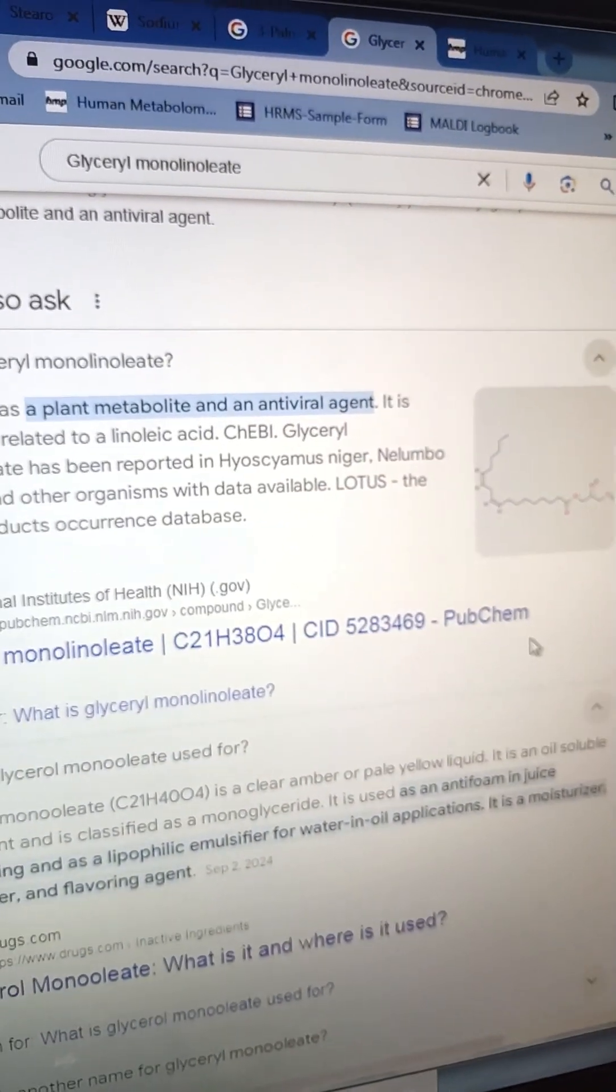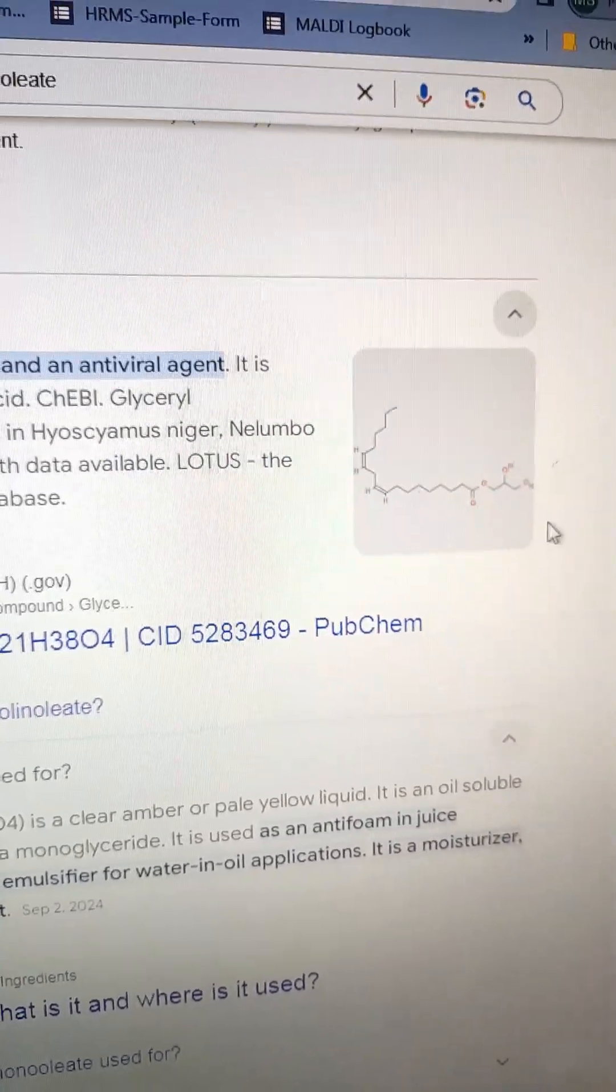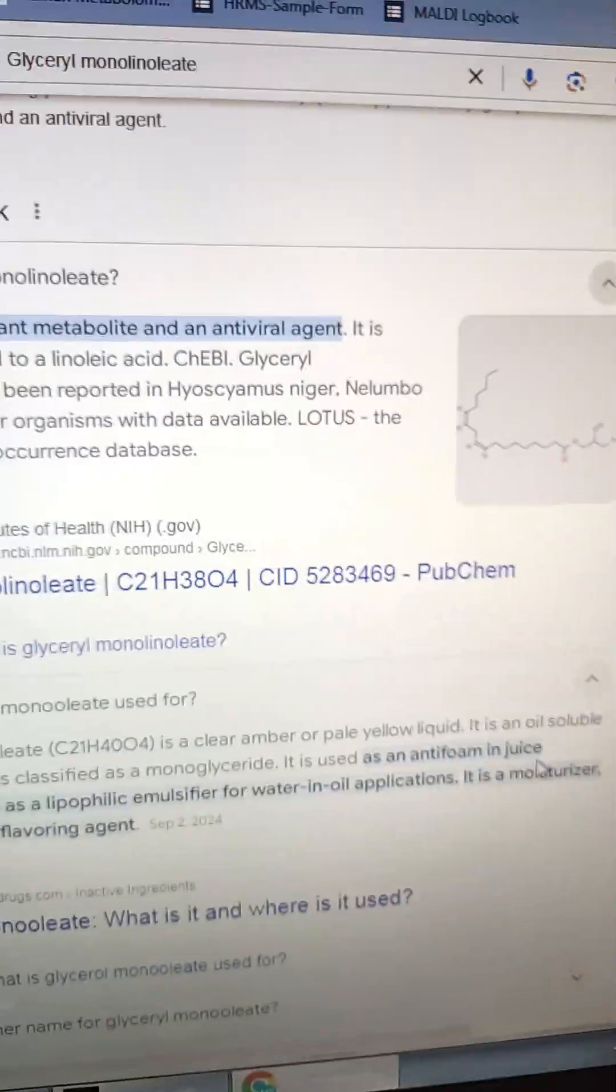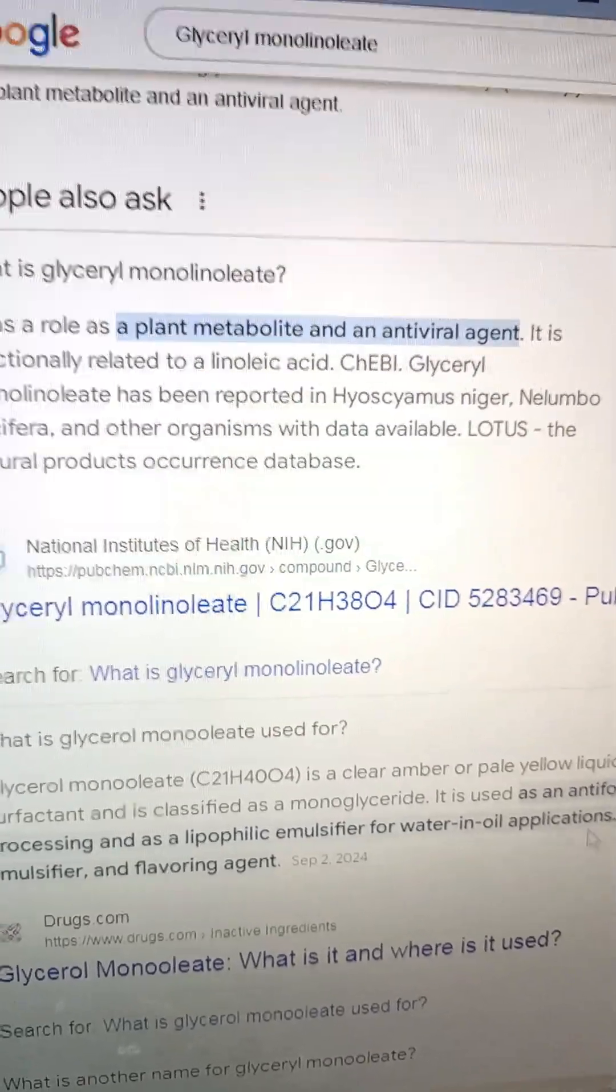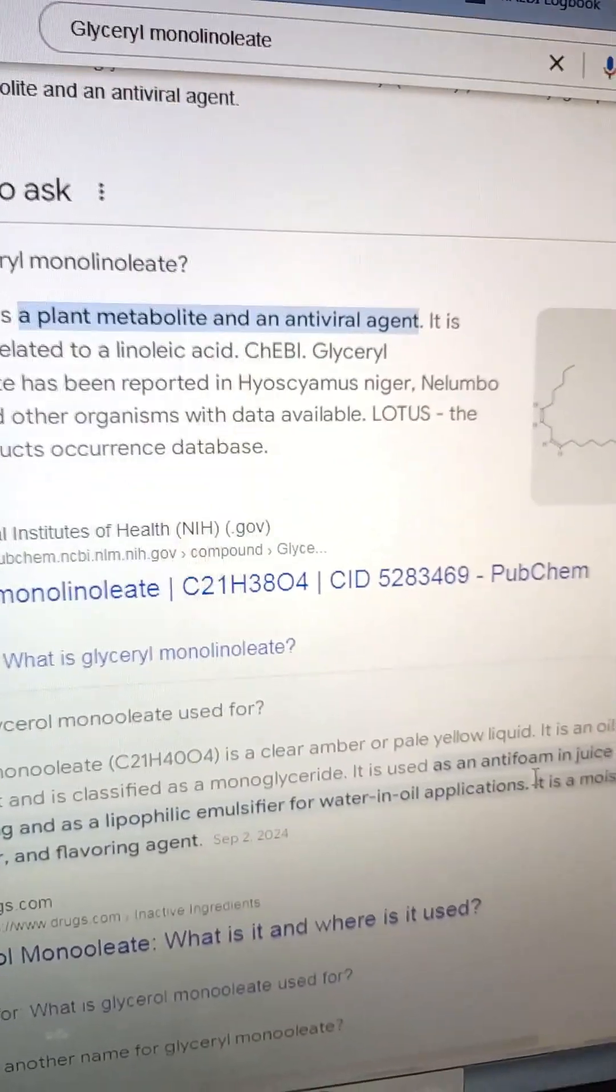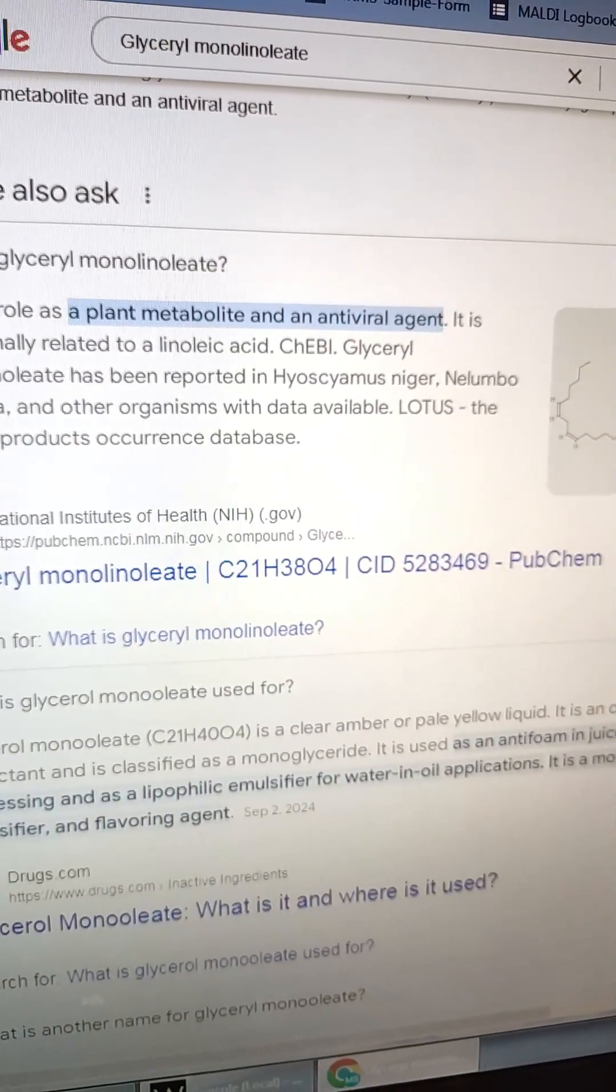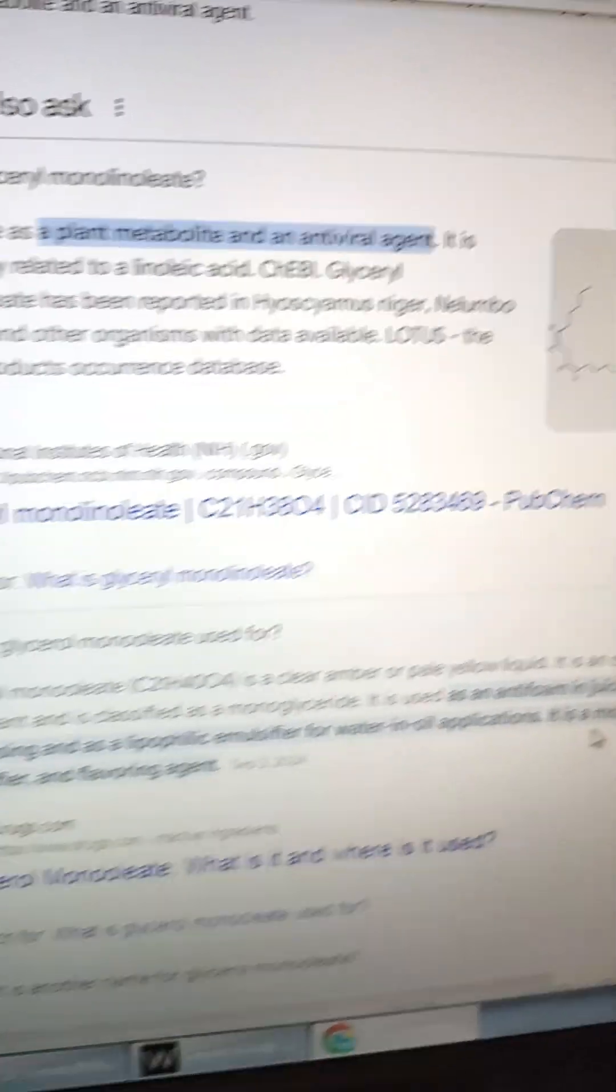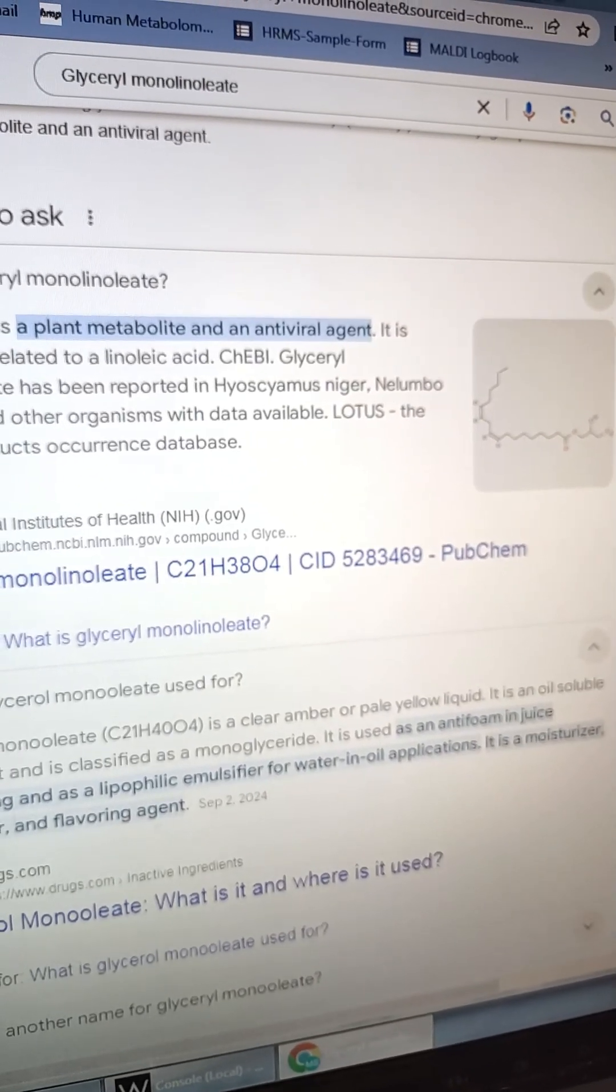So the first thing we're finding in here is the 355. That is going to be linoleic acid with a glycerol on it. So glycerol monolinoleate. It's basically just linoleic acid with a glycerol still attached to it. Or potentially they're making it exogenously as an oil and water emollient and flavoring agent. So it is a moisturizer, emulsifier, and flavoring agent. That's the first unique thing we're finding.